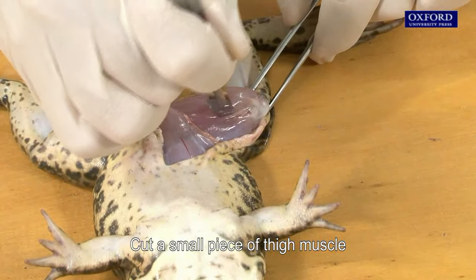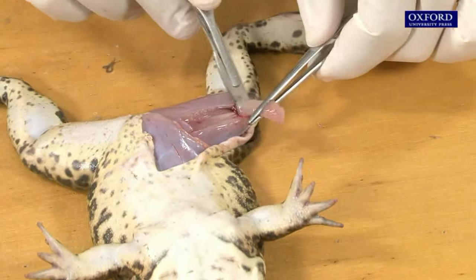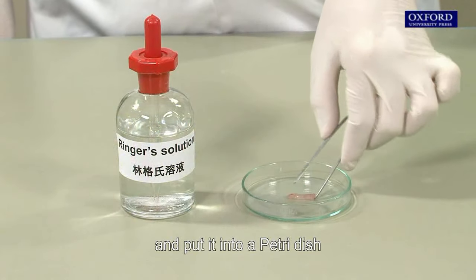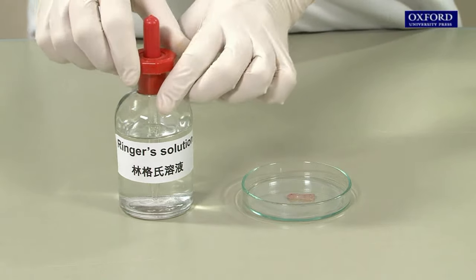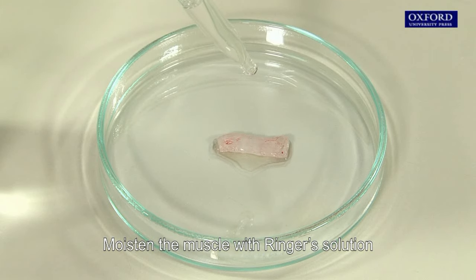Cut a small piece of thigh muscle and put it into a petri dish. Moisten the muscle with Ringer's solution.